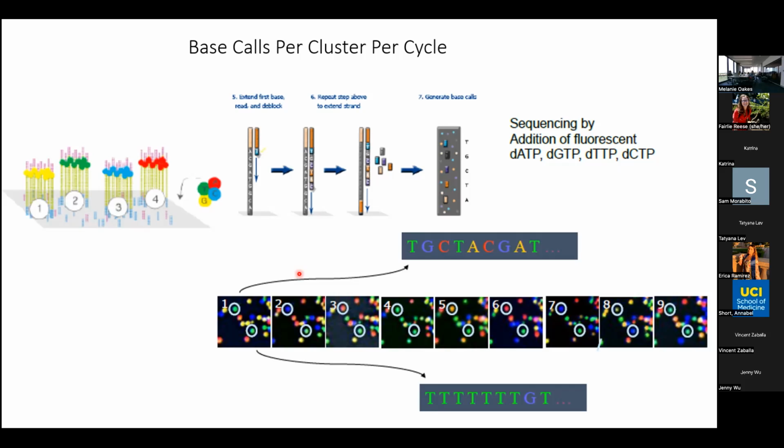So about the cycles, is there a recommended number, or how do people decide, or is there a minimum? That's a great question, because typically we're going to do paired-end 100 for sure on this. But you can also think of it that if we're doing paired-end 100, you've now got 200 bases. If your insert size is only 100 bases, then on the paired-end read you're resequencing the exact same thing that we sequenced on the forward read, right?